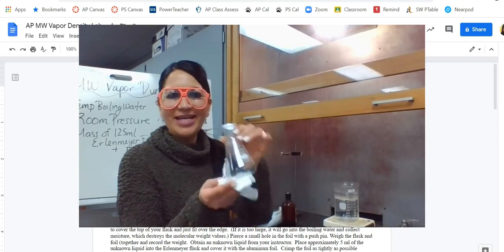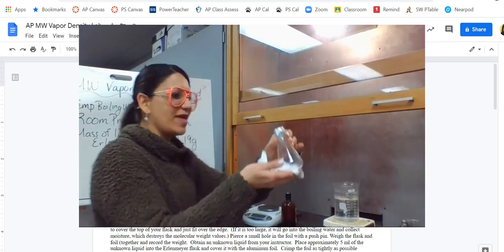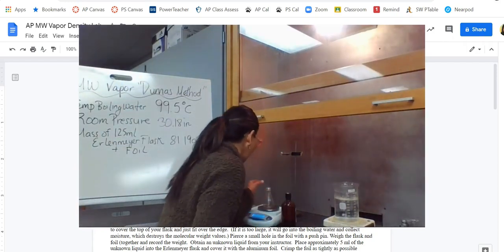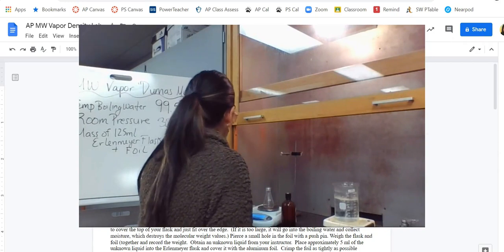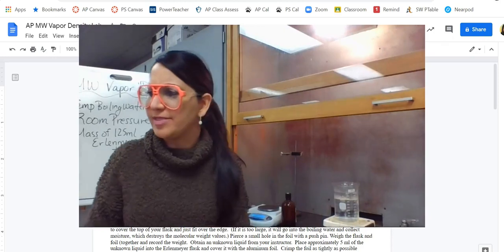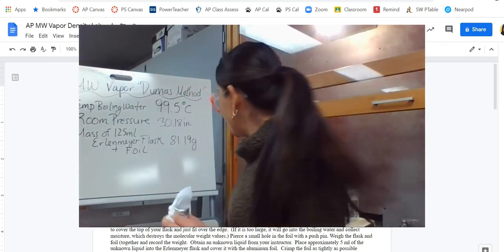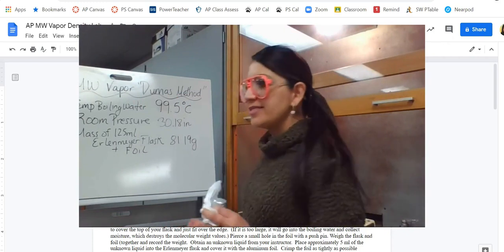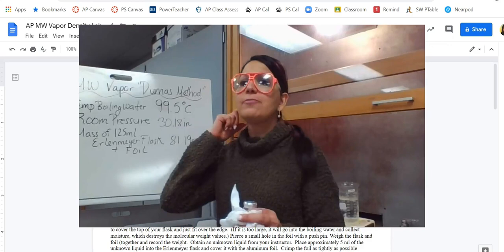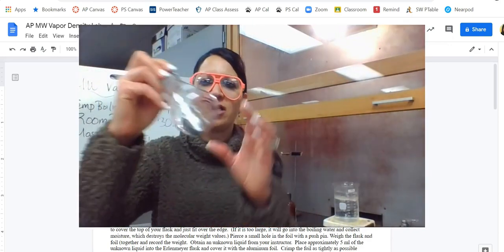All right, so I've got it. I ran it under cold water. I have the condensate in here so that all of the gas, let's just weigh it and then I can explain this to you after. Okay, so it's looking like 81.56 grams. Everybody write that down, 81.56 grams. What is this? So this is now going to be the mass of the flask foil plus the condensate. So 81.56 grams. All right, let's talk about this for a second.